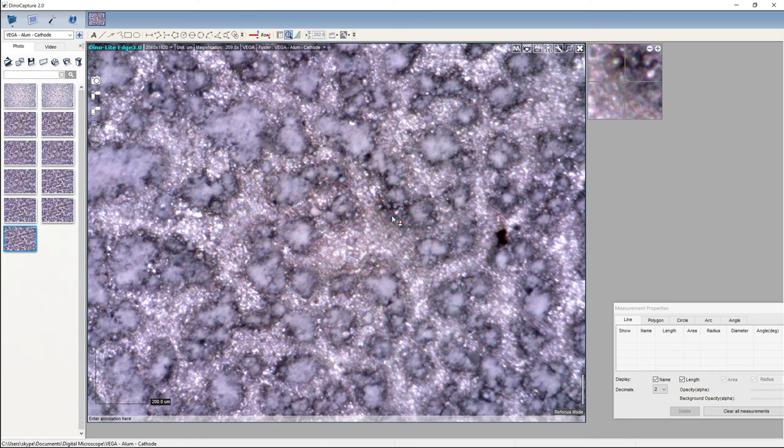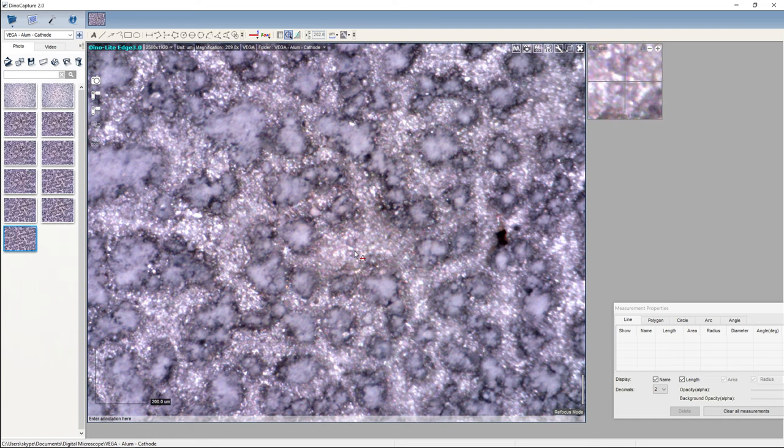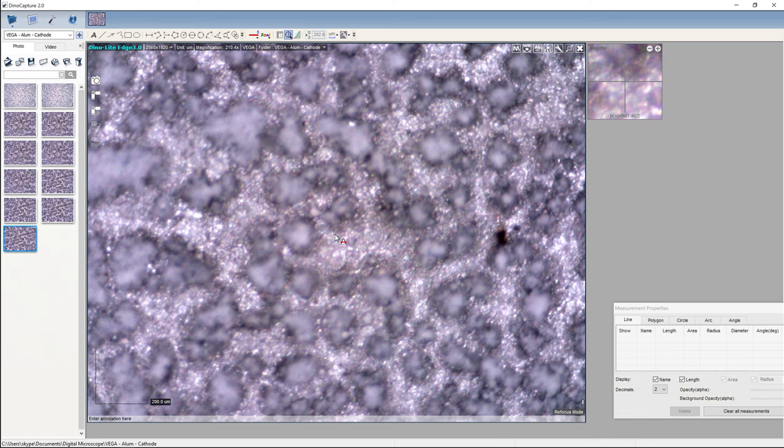What are these round balls here? That's going to be interesting when we look at that under the SEM. Now, when we see this doing things in the reactor, we see these kind of explosions and then these things running around. What are the things running around? And it looks like they're running around in these channels. Maybe. Who knows?